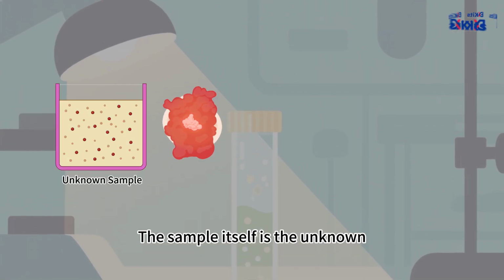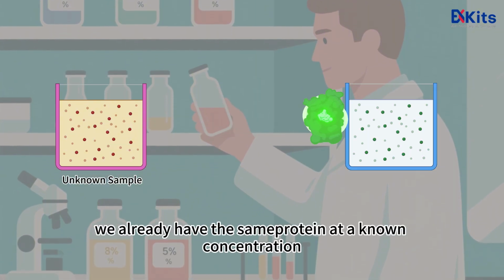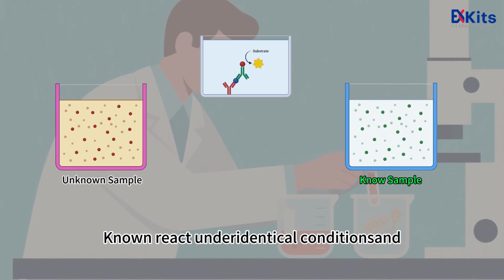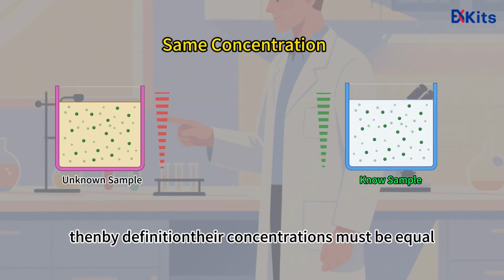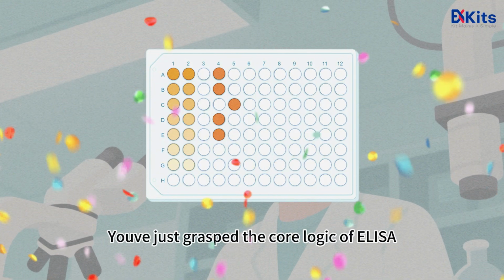The sample itself is the unknown. Let's flip the problem. We already have the same protein at a known concentration. If we let the unknown and the known react under identical conditions and they give identical signals, then, by definition, their concentrations must be equal. Congratulations! You've just grasped the core logic of ELISA.